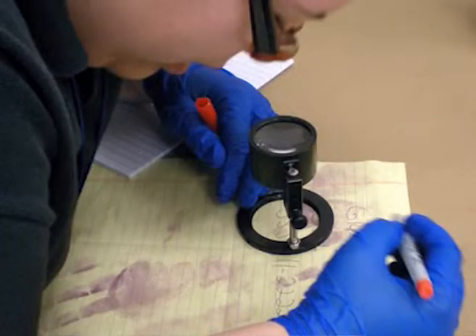Next, we will be talking about the post-treatment of developed fingerprints. Although the Ninhydrin method is considered to be a standard procedure for developing latent fingerprints, it suffers from a number of demerits. The chemical reaction between Ninhydrin and the amino acid content of sweat deposit is quite slow and therefore the developing time is quite long.